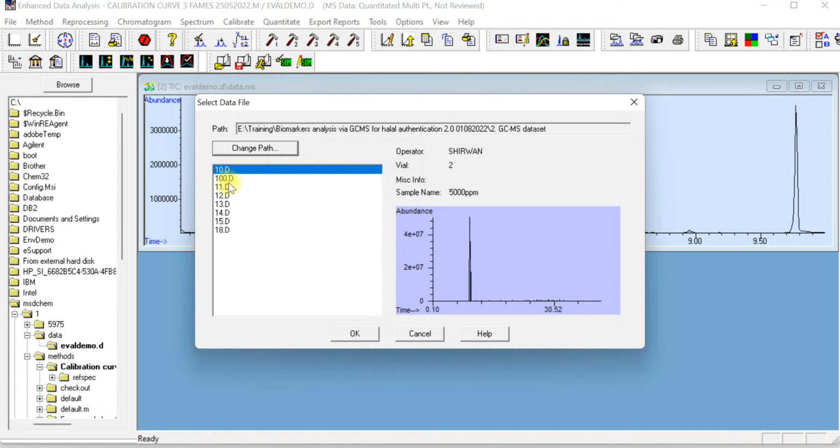Tapi kita boleh tengok dekat sini dalam the GC itself we put number 1 hexane blank. Ada satu folder tadi kan? Dalam GC at the instrument ada instrument. So you can see if you click here, data number 10 dot D means data.